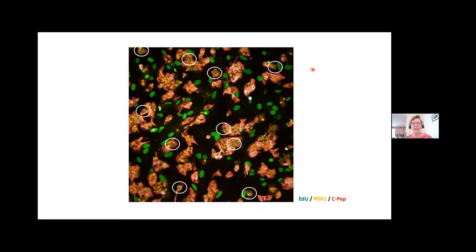Yeah, great. For our proliferation studies, we let them adhere overnight. We plate the cells, put them in the incubator, and then the next day change the media and add compounds. The acute 2-hour GSIS would have been overnight as well, but for the 6-day assay they're in place for 6 days.